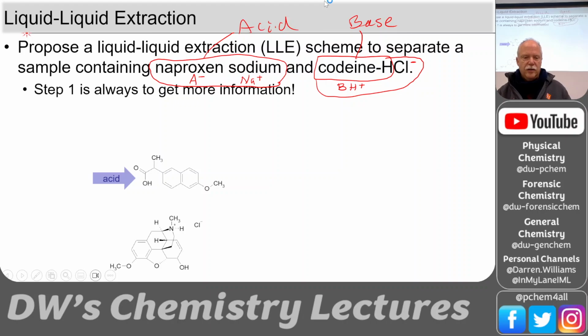And here's the HCl. So here's the base. So that base right there has been protonated. So here, this is the HCl part. So they protonated the base. That's the BH plus. So this whole thing right here is B. Okay, BH plus and a Cl minus. That makes a neutral salt, and it drops out of organic solution.